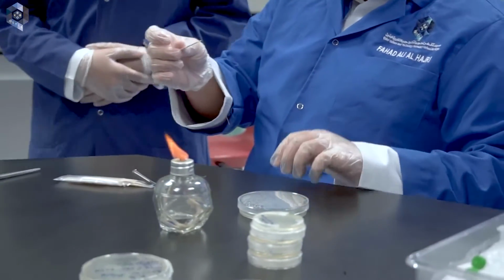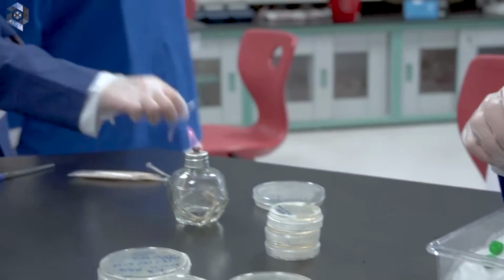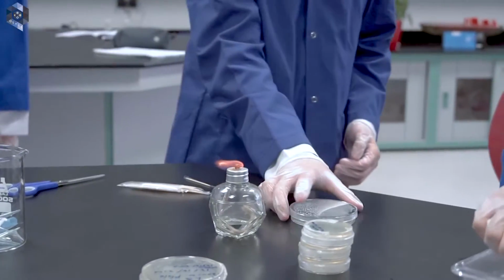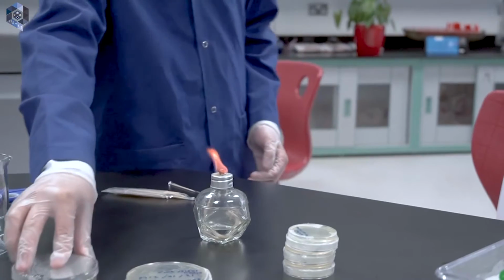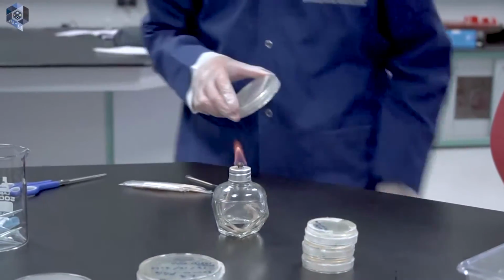Close it, put it in the corner. Now, next student. Use another source plate now. Put this source plate aside, okay? Take another one. Quickly, remove the parafilm.